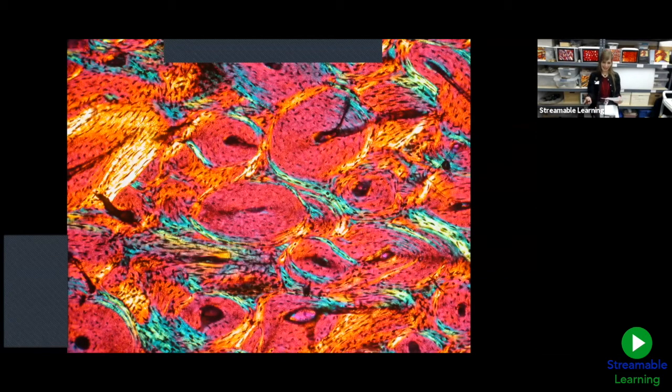So I'd like to say, since we cannot stain dinosaur bone as the biological remains that would be in modern bones, such as proteins and antibodies, have decayed in almost all conditions, not all, but almost all conditions with fossilized material, then we can use polarized light to stain the bones. So Ellen Therese, is it correct that it's the special microscope that you have that's making the colors that we can see in the pictures behind us?